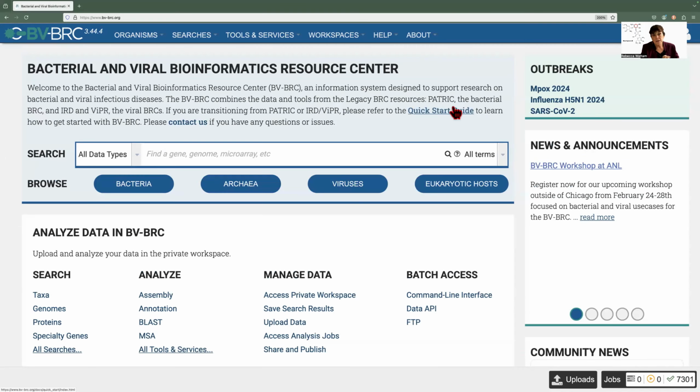We talked about annotation and what is involved in it, the different pipelines that are available at BV-BRC. We've submitted a job. We've talked about the files and formats that come with the job. But now let's look at one of the jobs we did.